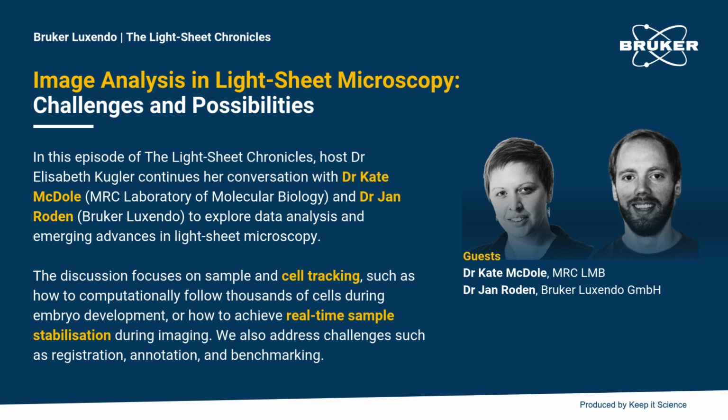Because if you have a multi-view experiment, so for example, you have multiple objectives, or you have a rotation stage where you can have views from different rotation angles, and in the end you want to somehow fuse this data, or maybe even do a multi-view deconvolution of the data. For all of this, good, accurate image registration is the first crucial step, because otherwise you can't even do a multi-view deconvolution, right?